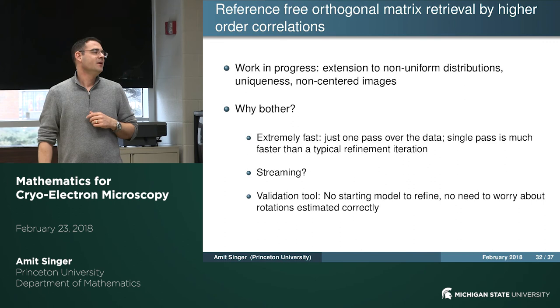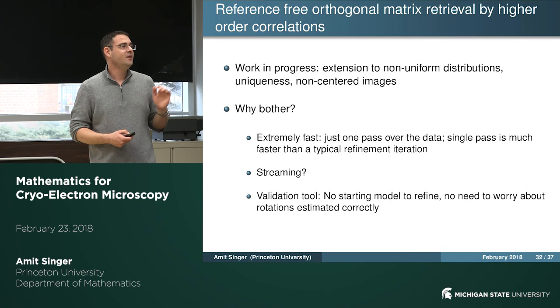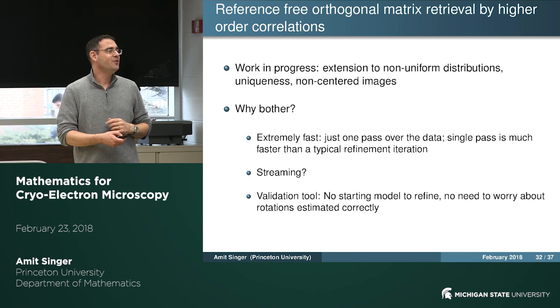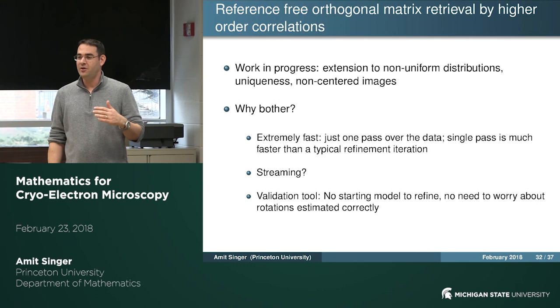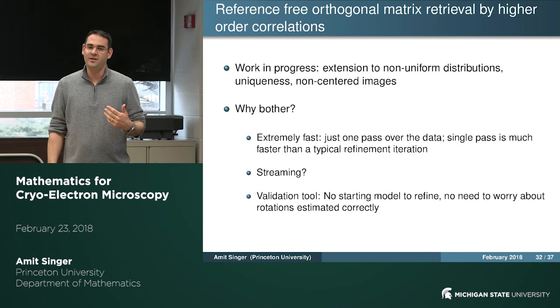So you can ask me, okay, why should you bother? Because there is already maximum likelihood, which has so far prevailed, but there are some very strong advantages of doing the generalized Kam method. One is that it is extremely fast. You can just compute the moments by one pass of the data, and it can even lead to the possibility of doing Cryo EM by streaming. You don't even need to store the data.